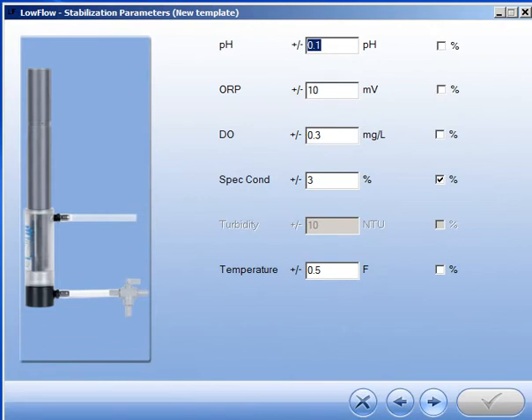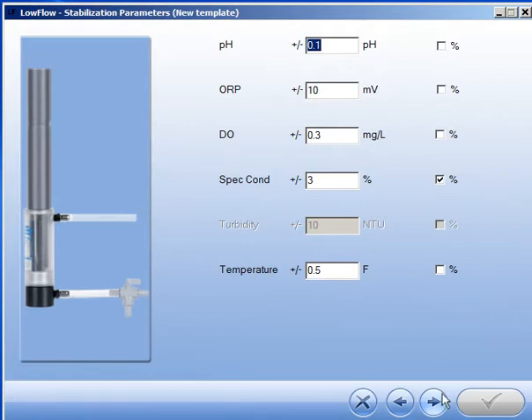This screen shows the common low flow stabilization values. If your application requires different values, you can change them to meet your needs. You can select either absolute values or percentages by selecting or clearing the checkbox.